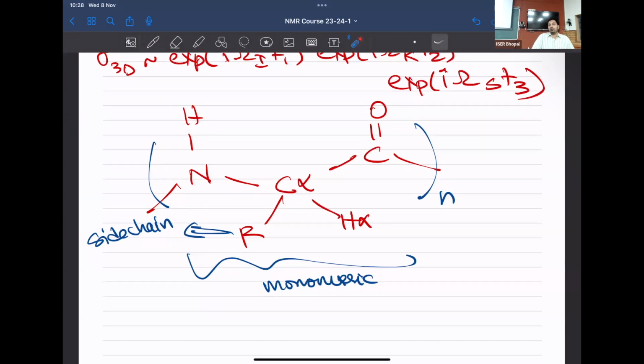I'm not sure how many of you would have taken a biophysical chemistry course. One would understand the angle subtended by the NHCO is more or less in that trans orientation, meaning that the carbonyl and the H would be trans with respect to each other. Peptide bonds, this is called an omega angle, are almost always in the trans dihedral angle. All right. On the other hand, whatever you end up getting in the phi and psi, which are also called the Ramachandran angles, you would end up getting information on what conformers are adopted by a given monomer.